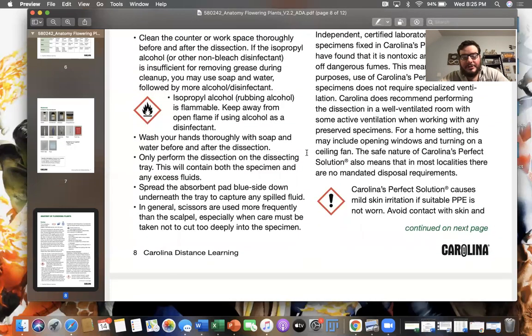the scalpel. All right. So important with scalpel care and how you use your scalpel. So never recap it. It's disposable. So once you take it off, it's off. If you have to recap it for any reason, do so very, very carefully. All right. When you go to uncap it, grab up at the top, grab at the base, and just pull straight. Don't put your hand here and pull.